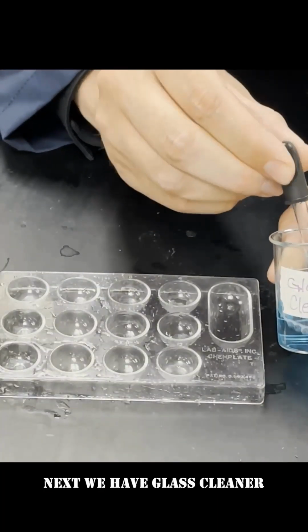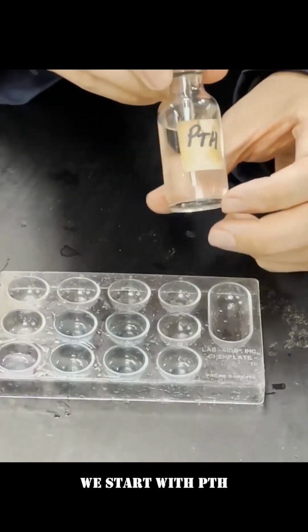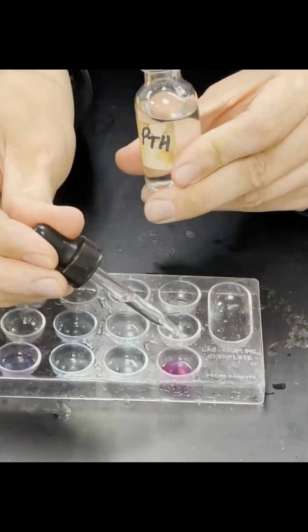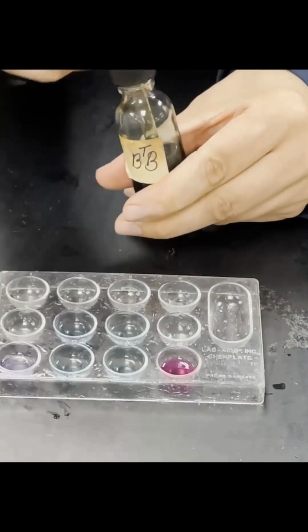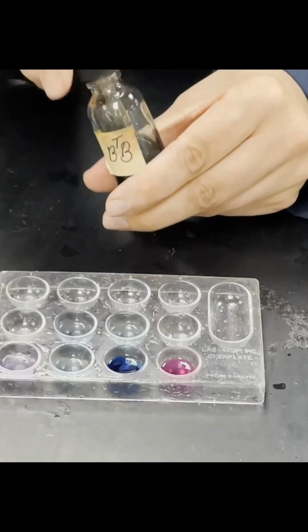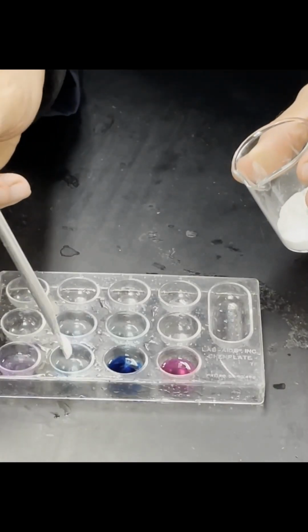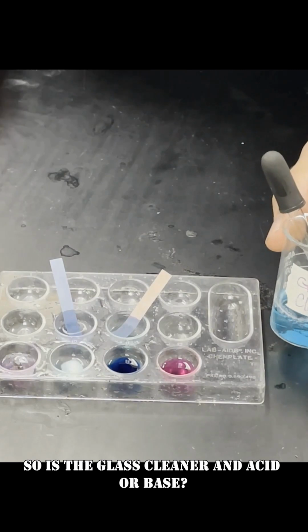Next we have glass cleaner. We start with phenolphthalein. Bromothymol blue. Carbonate. And litmus paper. So is glass cleaner an acid or a base?